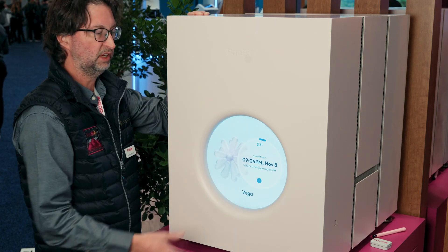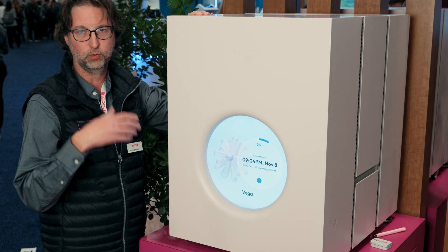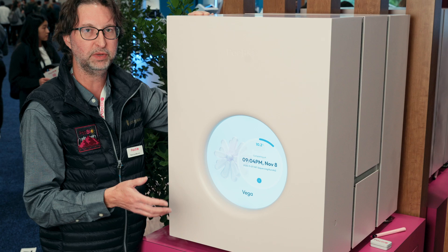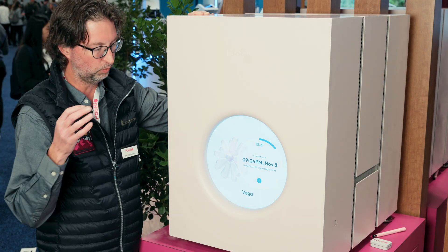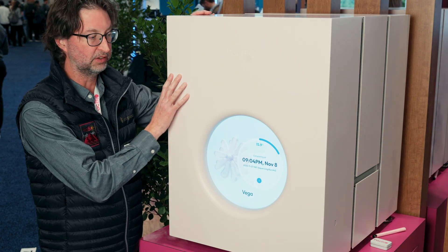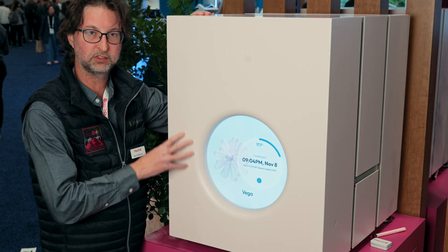Now, while it's sequencing, let me tell you about our award-winning technical support. We have the best technical support in the business who want to help you be successful. They're going to help you with the sample prep, with the instrument, and with the bioinformatics — though none of that's going to be necessary because this thing is so simple to use.